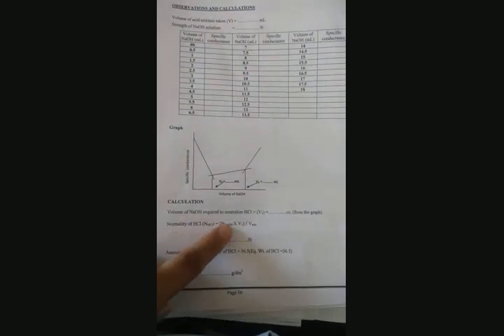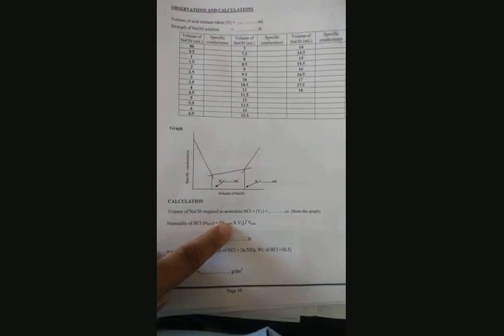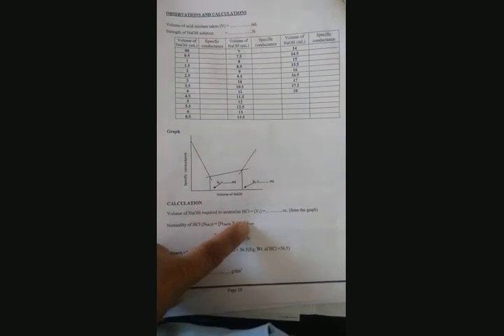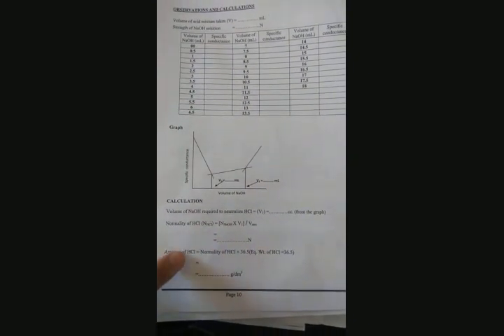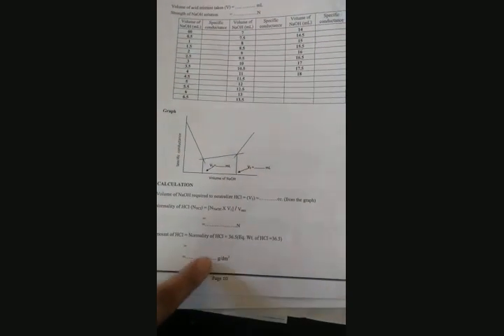Normality of HCl is equal to normality of NaOH, which is known, 0.5 or 1 normal, into V1 from the graph, divided by V mix. This V mix is the amount of acid mixture prepared. Once you know the normality of HCl, the amount of HCl can be calculated: normality of HCl into 36.5, you will get so much gram per dm cube.